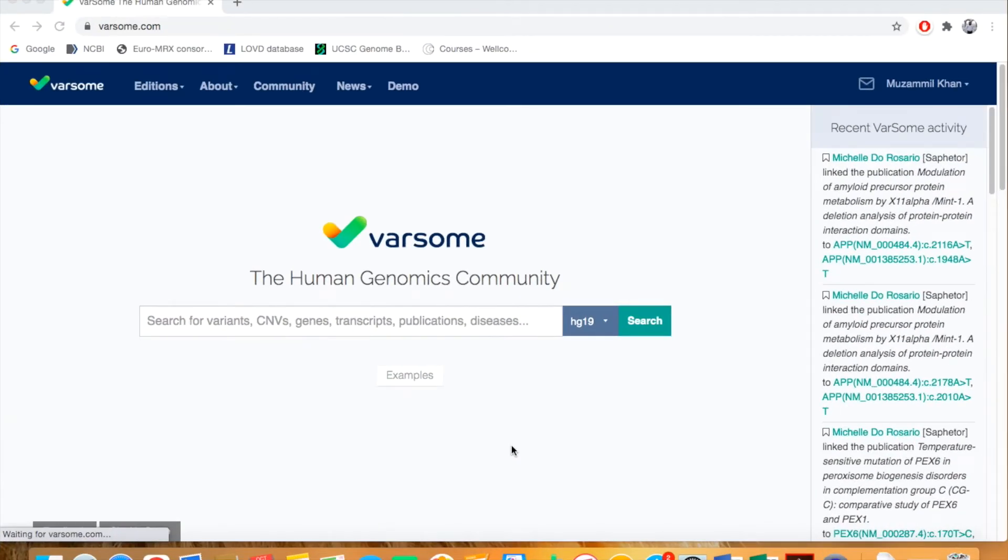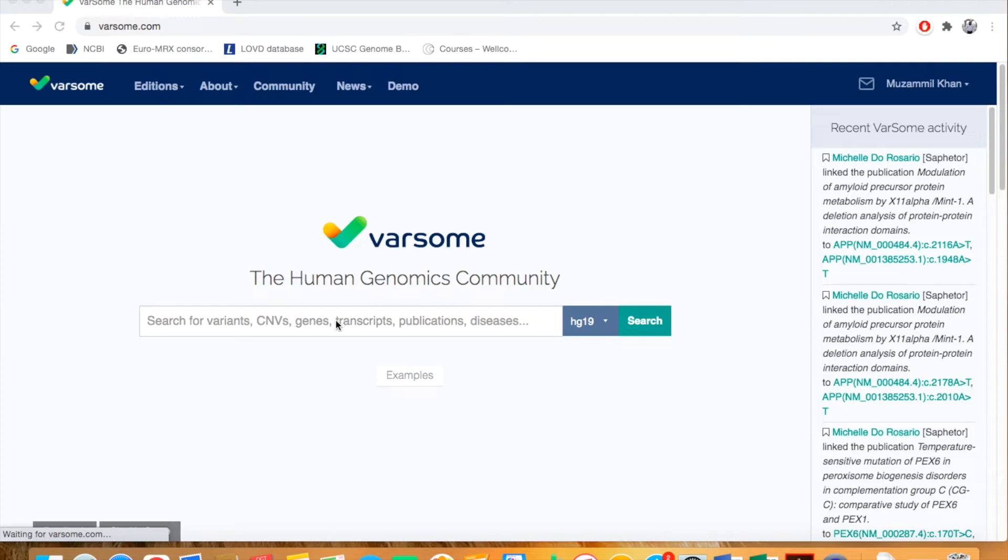This is the home page of the clinical variant interpretation tool Varsom. This is the query box where you can put in the variant of your choice, and you can also change the assembly here.